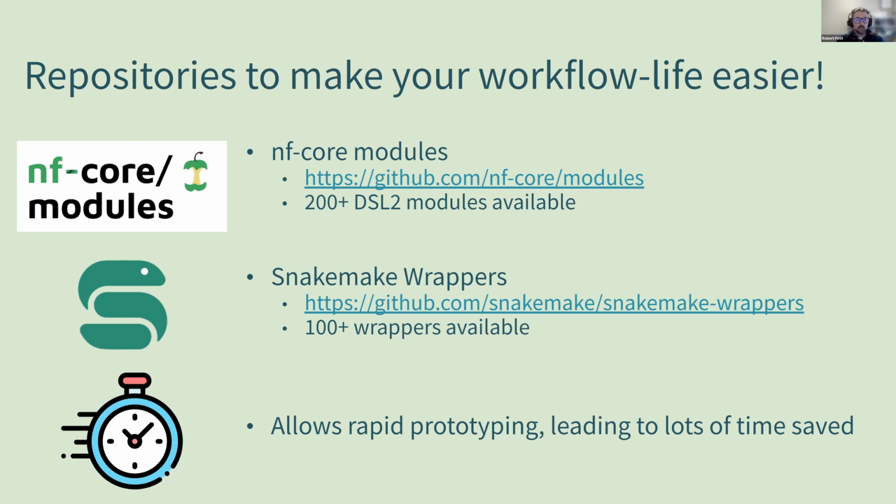And so there are a few repositories to aggregate these into a curated set of Nextflow modules. There's the NF Core modules repository, which has 200 plus DSL2 modules readily available, and you can import those into your Nextflow. They have a tool set that allows you to easily import these at the command line. And once you import them, you can either use them directly or modify them to fit your needs.